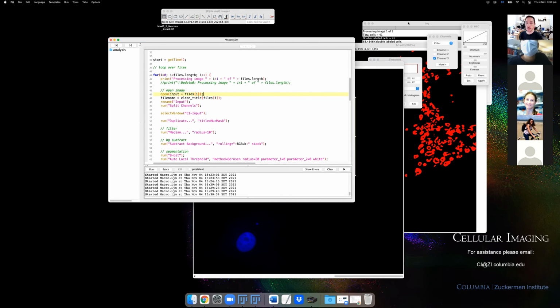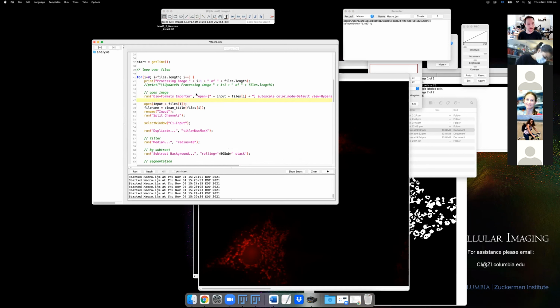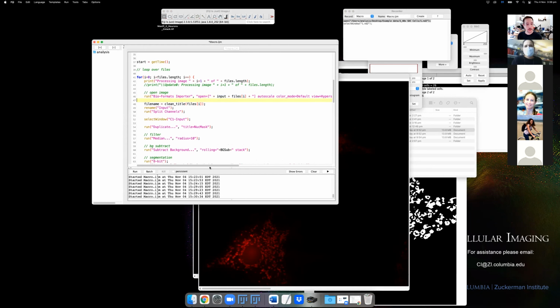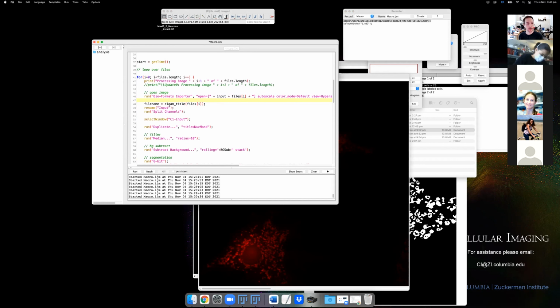This is where we need to use bioformats. We can replace that here. So let's put that in here. It's just the same variables we used before. And these are all the parameters that you could change in bioformats. So there's a lot of really great things you can do for other more challenging projects, but we don't need to worry about them so much for this. But just be aware that they're there. We can use our file name.